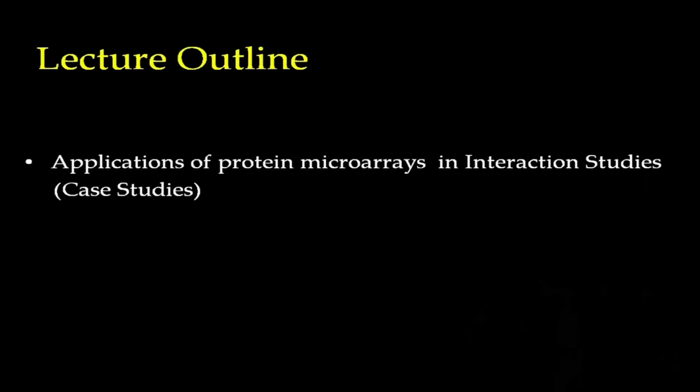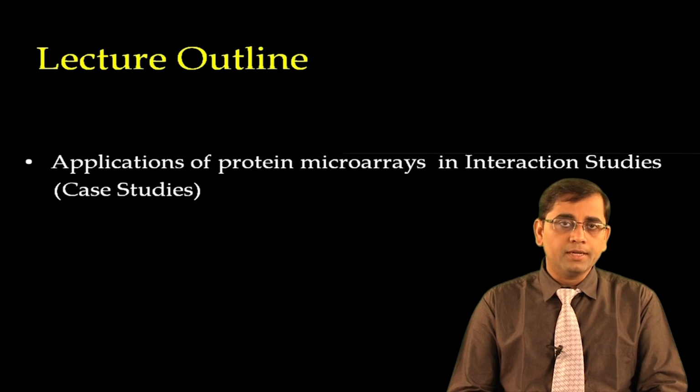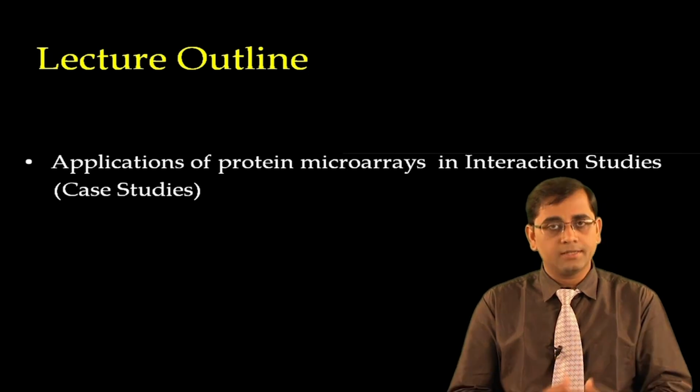In today's lecture, we will continue our discussion about applications of protein microarrays. In our previous lectures, we have discussed many examples of use of protein microarrays in the area of biomarker discovery. Today, we will discuss the use of protein microarrays for protein-protein interaction studies.